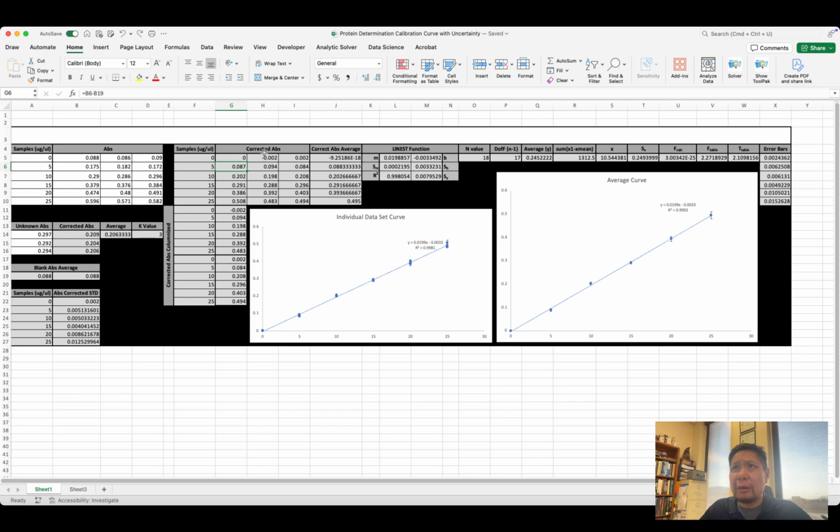And so what I could have done was put in the dollar sign in front of the B and the 19, just like I did for this over here, but I forgot, so I just hand typed in each of them as B19. But to save time, you could just put B19 in dollar signs, and it will hold it there for you. It won't change the cell as you drag, right?